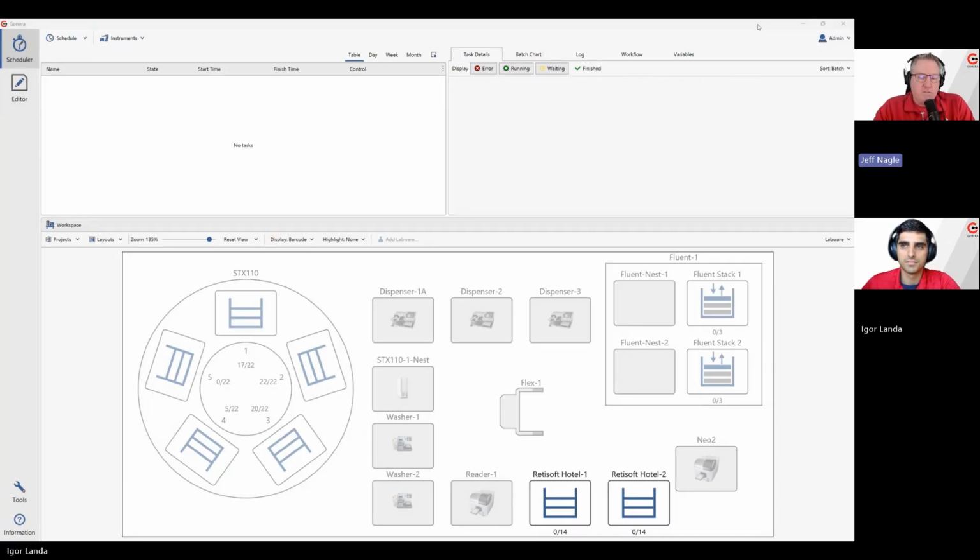When we talk about workspace, you may have different workspaces like you see below on the screen here, but it has different pieces of labware or other things that maybe you want to bring into another instance of Genera because you don't want to create these every time by hand, every time you create something new in the software. Go ahead and get started. Let's see how this works.